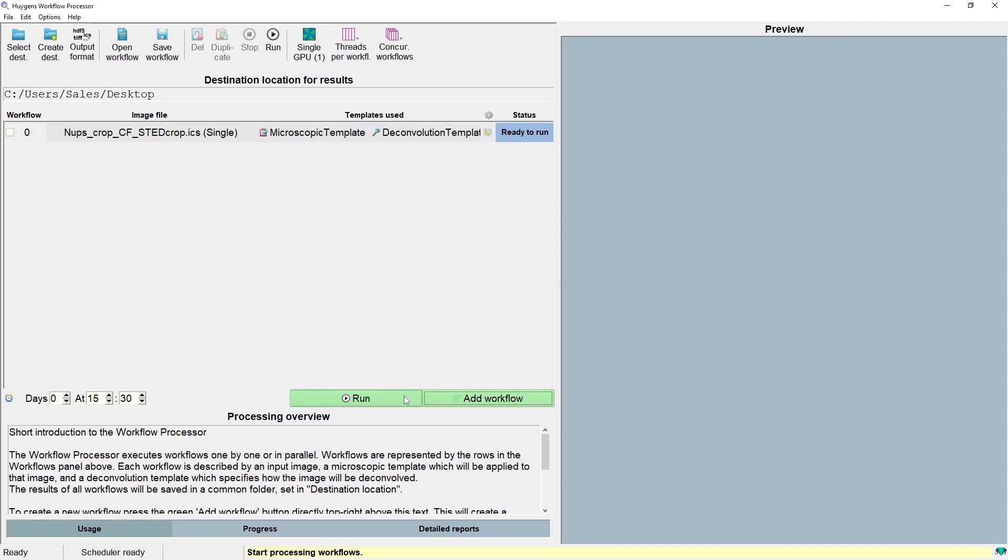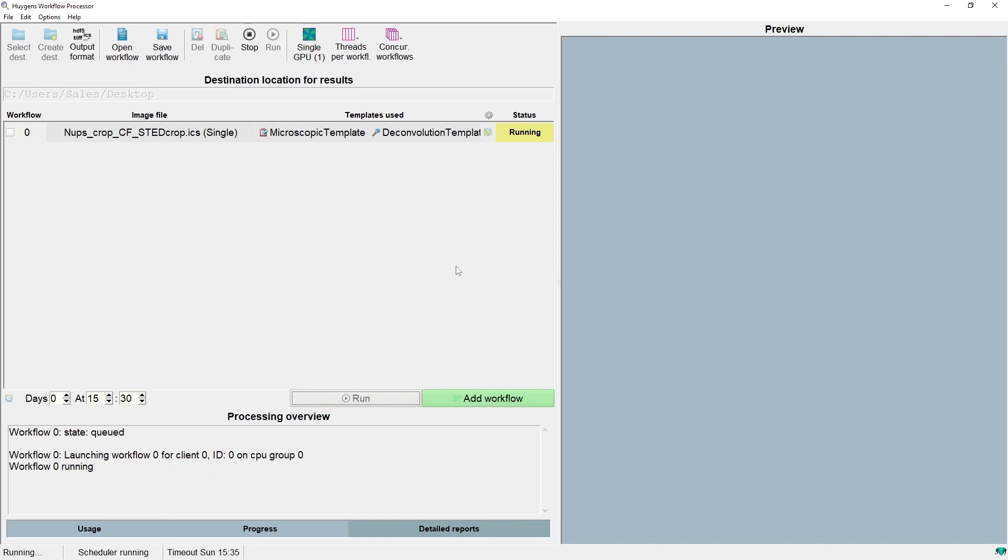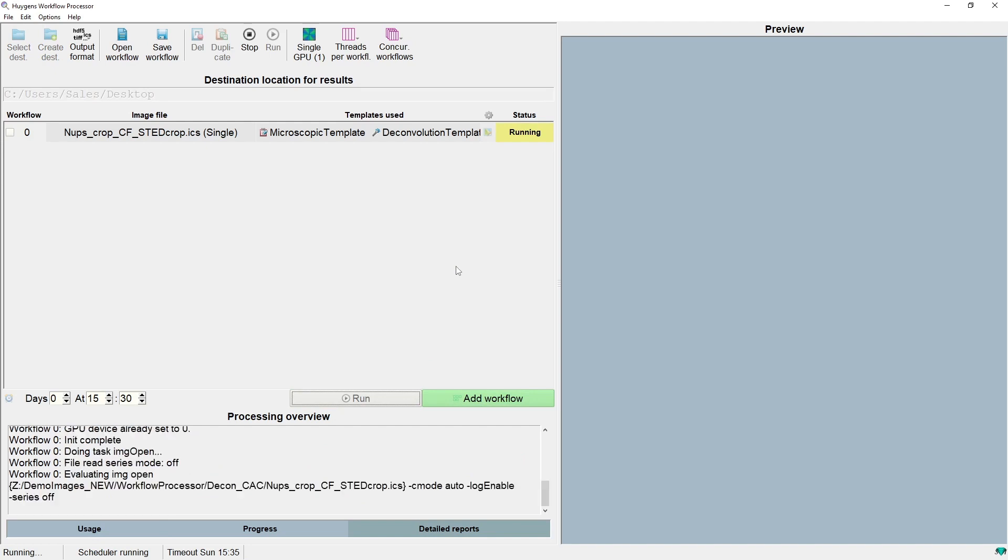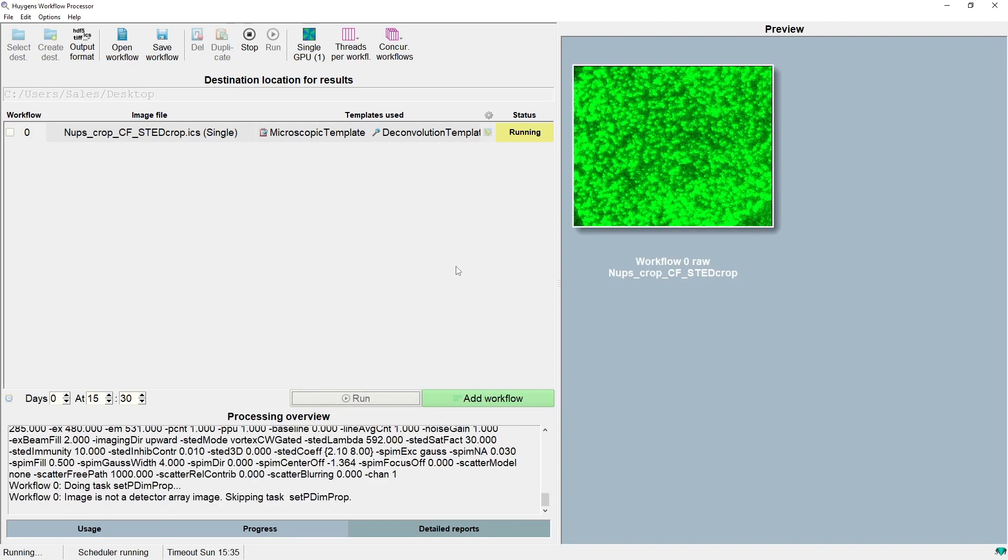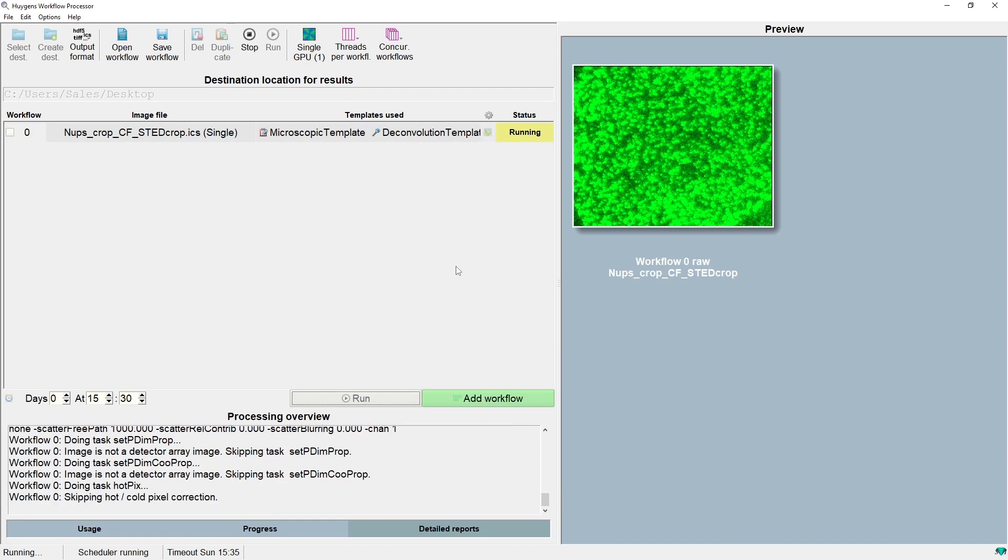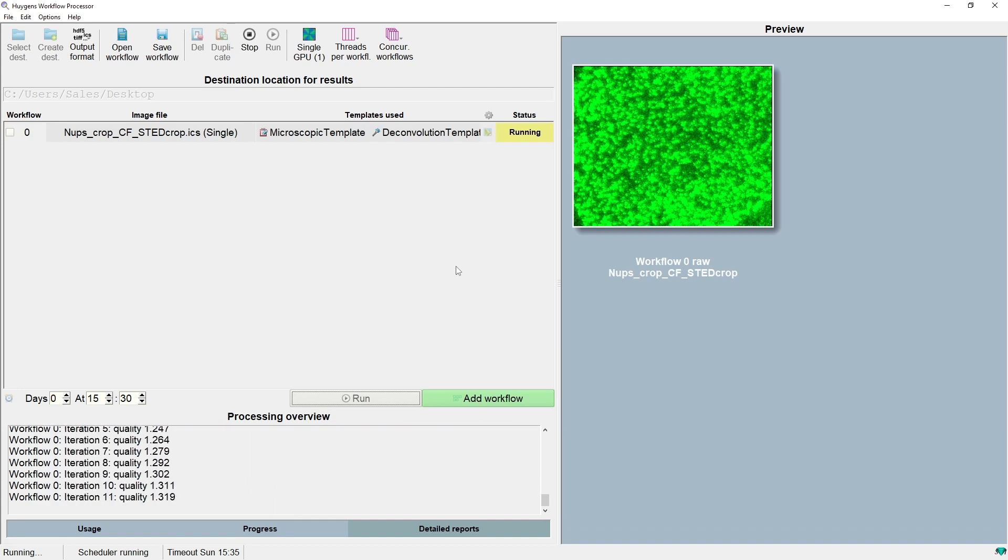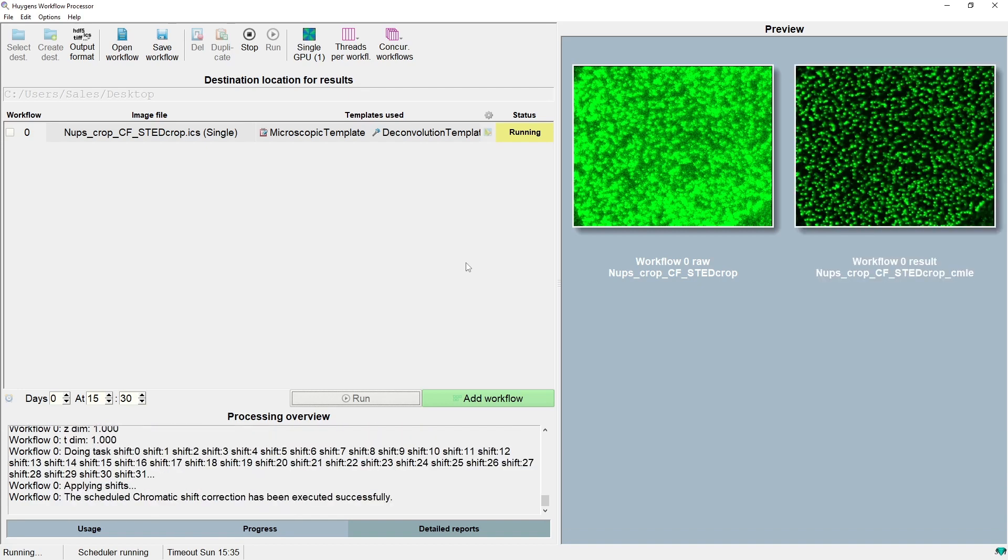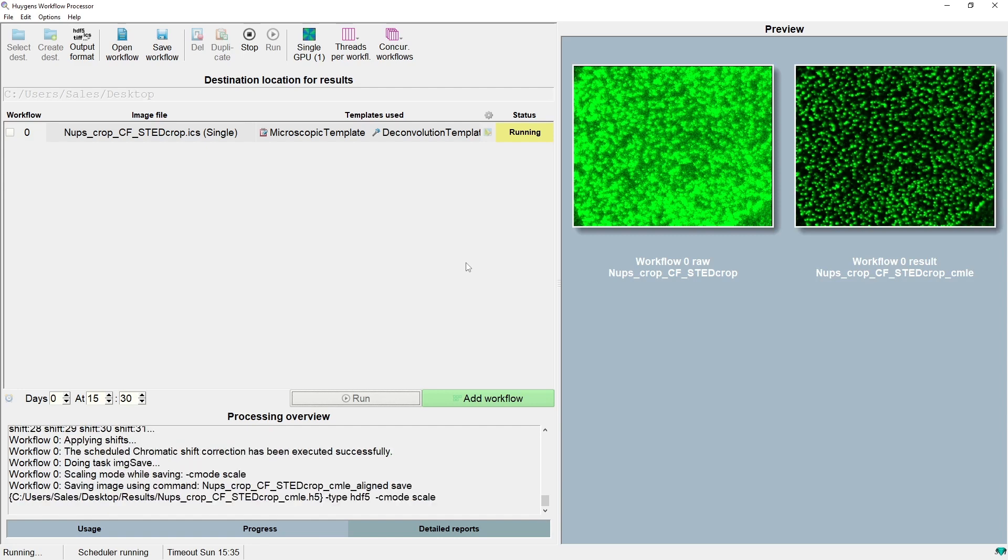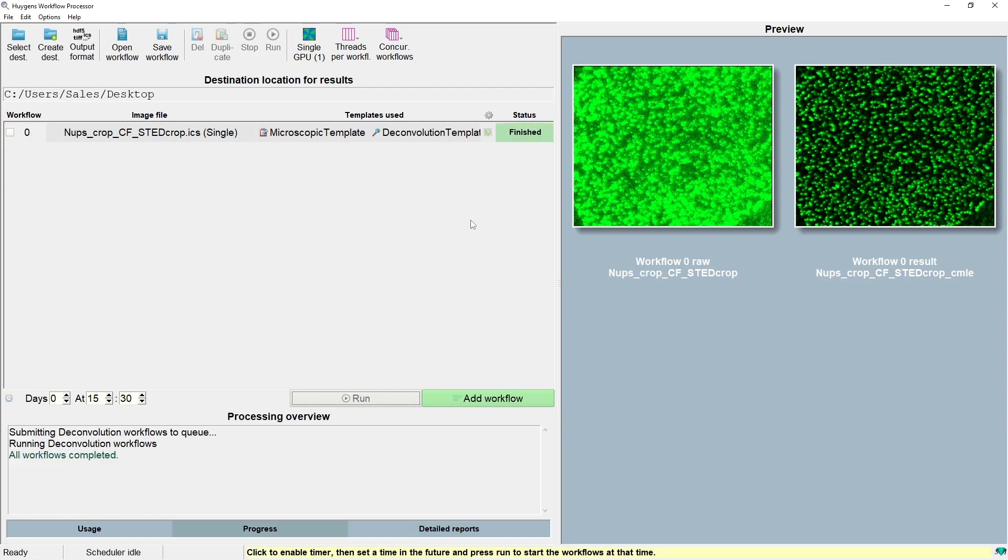If we click the run button the workflow processor will execute the workflows, and while running we can see exactly what is being processed via the previews and the changing statuses in the workflow overview. It has now finished the first channel and now the second channel which quickly updated the preview of the result. And now the status is also gone to finished. This task only took a short time, but even in this case using the workflow processor we didn't have to open the various specific tools in Huygens to do this processing.